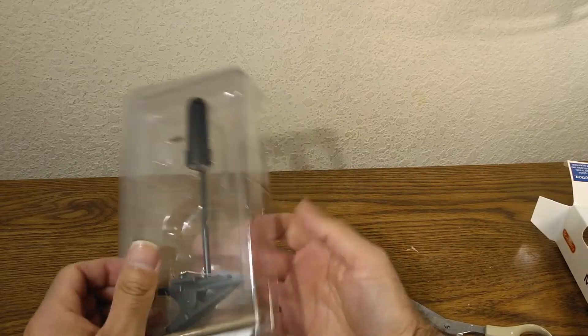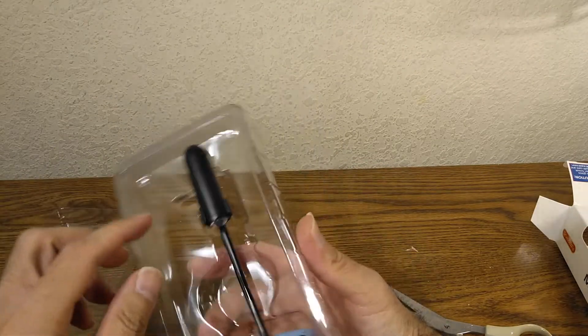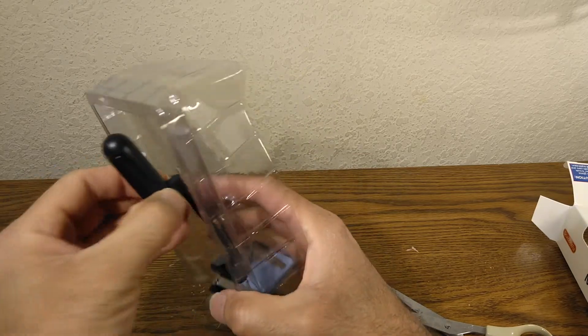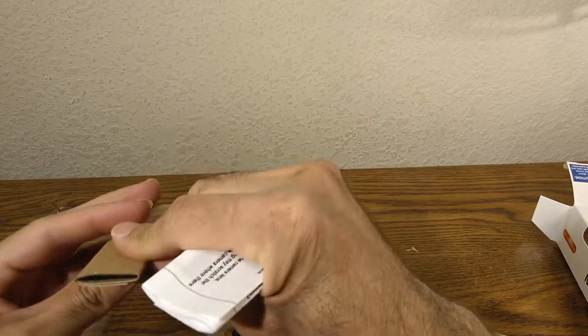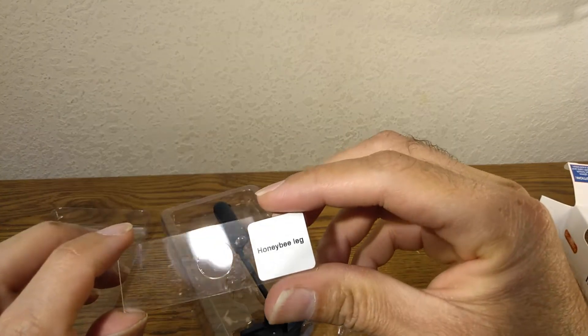Okay so this is it right here. As you can see, you get the microscope, some instructions, and something else — a honeybee leg.